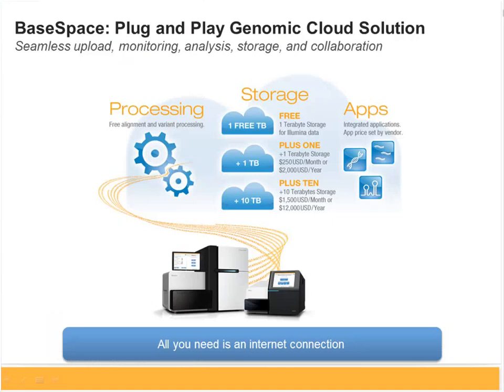So what is BaseSpace? It's a solution to seamlessly and securely upload, monitor, analyze, and share your genomic sequencing data. Its primary value or benefit to you is that fundamentally it makes genomic informatics analysis easier.